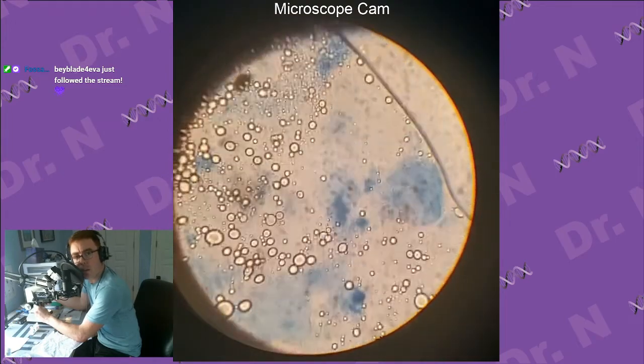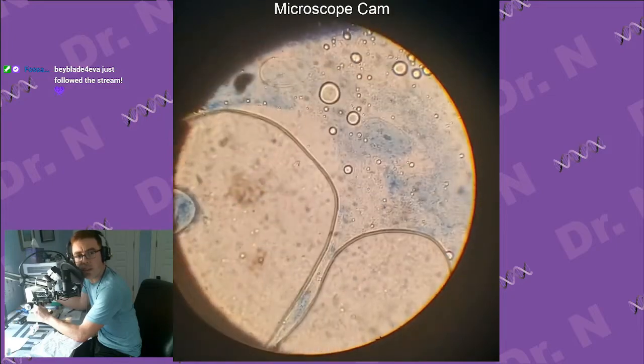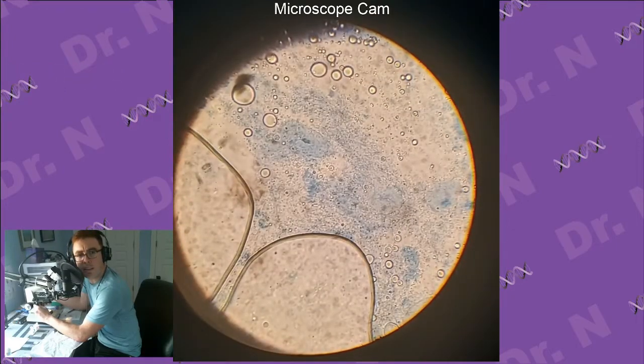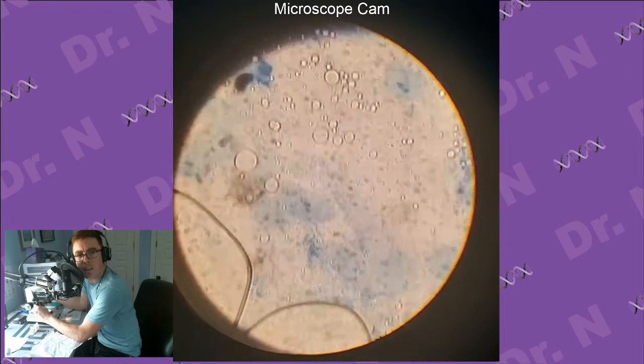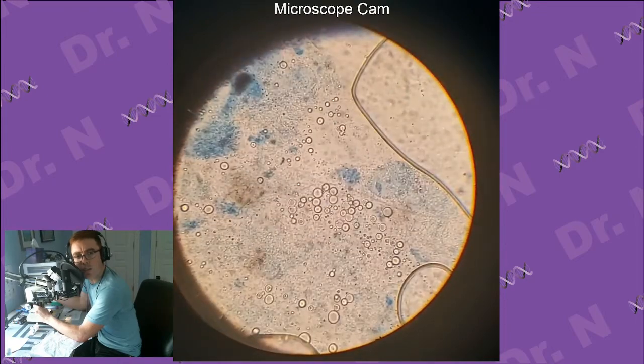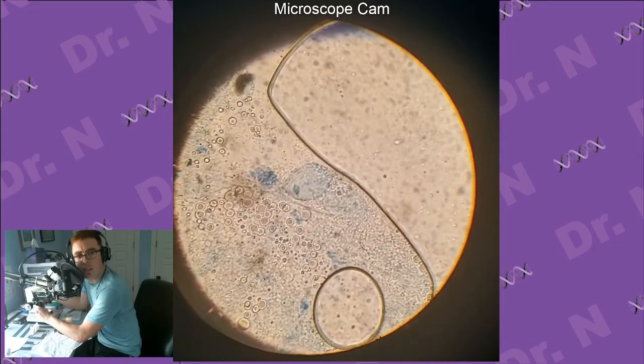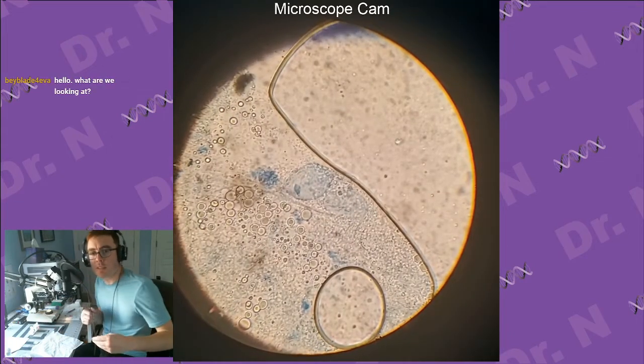Yeah, so all these darker bits are the cell's nucleus. Ooh, what is that? It's also very dirty, unfortunately. All right. So let's look at this one for example.